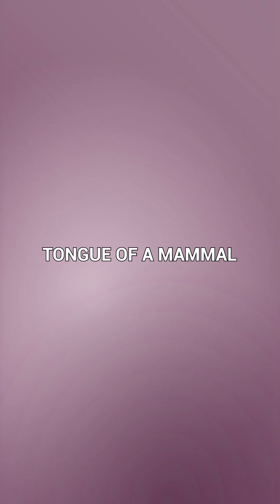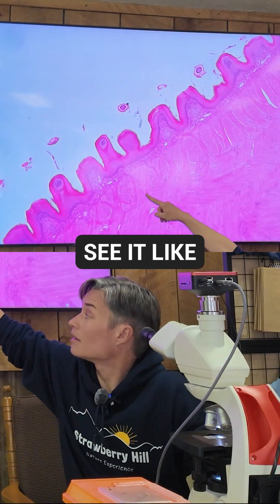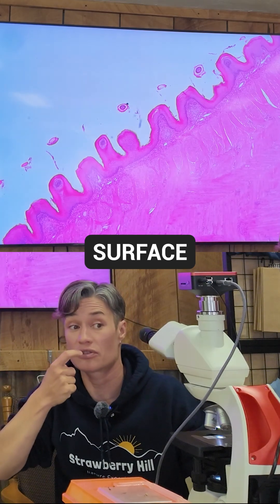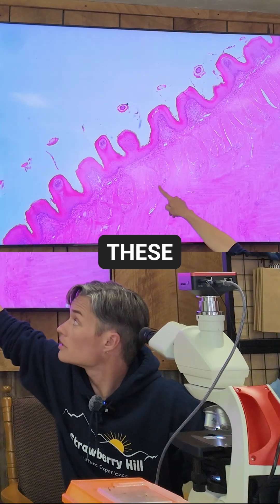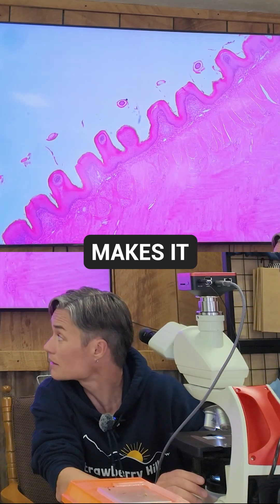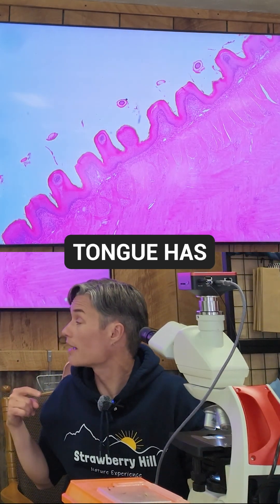This is a tongue of a mammal — or maybe a person — and this is pink. You can see the surface of a mammal's tongue. This is what you have on the surface of your tongue; it's to lick stuff so that it can stick into these grooves. Is that what makes it sticky? Well, partially — saliva makes it a little bit sticky, and then the architecture, the form that the surface of your tongue has.